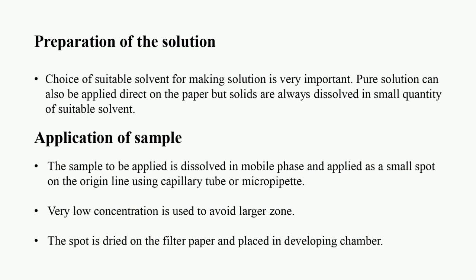Application of sample. The sample to be applied is dissolved in mobile phase and applied as a small spot on the origin line using capillary tube or micropipette. Very low concentration is used to avoid larger zone. The spot is dried on the filter paper and placed in developing chamber.